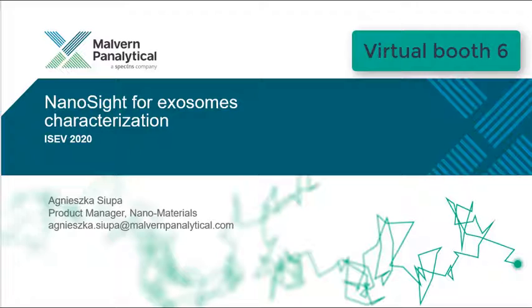It's a pleasure to discuss with you today how NanoSight assists researchers in exosomes characterization.